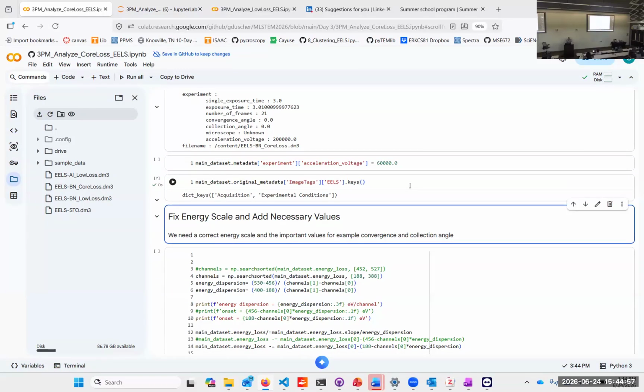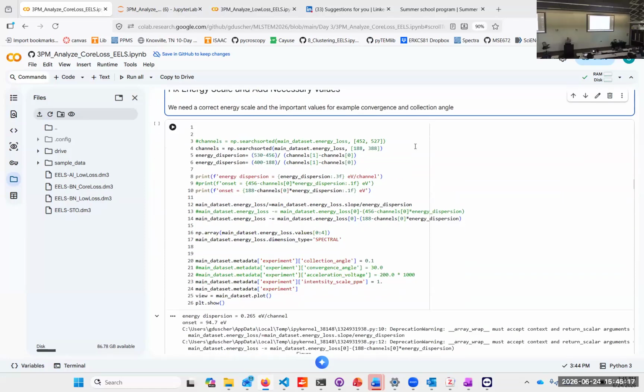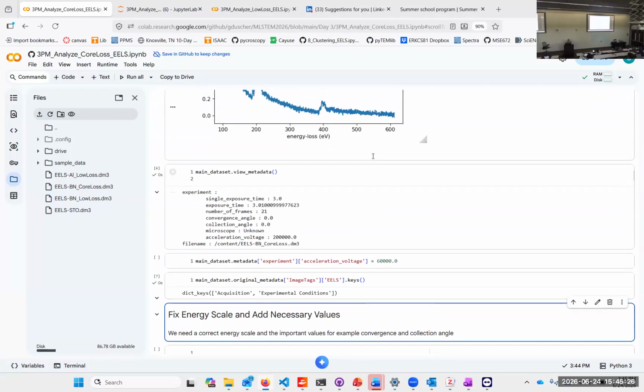Even so, everything is recorded in the original metadata, which is preserved when we read it. But if the parameters are not inputted and the computer does not communicate with the microscope, you have a problem. So better integration is necessary, and I complained to Gatan for years about that, and it's not happening.